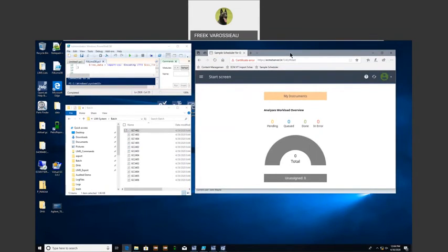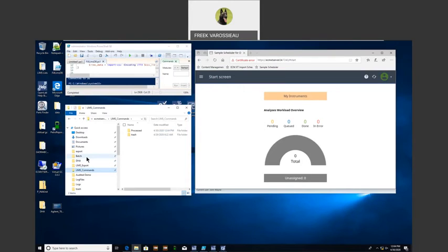Right. As I started my presentation and explanation of how we can work between sample scheduler and a LIMS system, we can have XML files being provided by the LIMS to the sample scheduler to put into the system. And I'm going to mimic with my mouse how a LIMS works. So I have here a bunch of XML files. So I'm going to select them all. And the LIMS generates those XML files. They create the XML files and drop them into an inbox of the sample scheduler. So I'm copying the work over into my LIMS commands, and it's being absorbed by the system. It's quicker gone than you think.